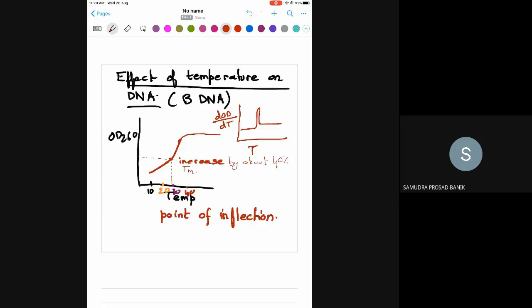So the protein was slowly denaturing. Now at a point it gets converted to molten globule. At that point of time, the specific heat capacity suddenly increases. So dH/dT gave a spike at that place in the graph. So in case of protein, essentially there was a phase transition.